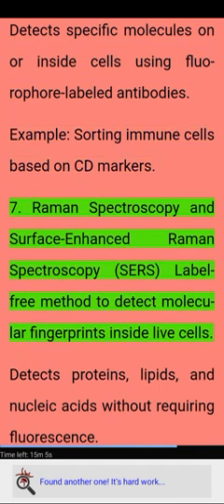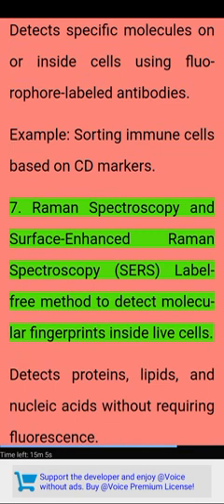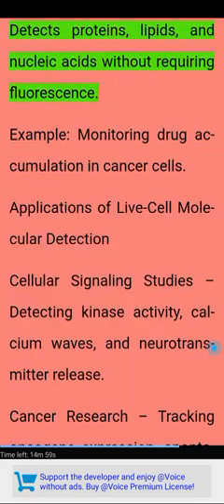7. Raman spectroscopy and surface-enhanced Raman spectroscopy (SERS), a label-free method to detect molecular fingerprints inside live cells. Detects proteins, lipids, and nucleic acids without requiring fluorescence. Example, monitoring drug accumulation in cancer cells.